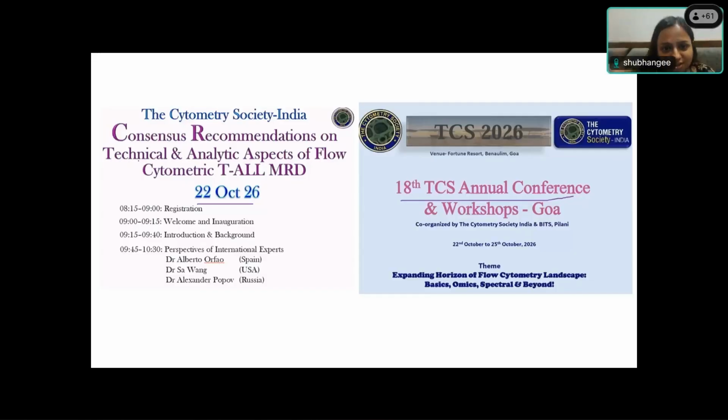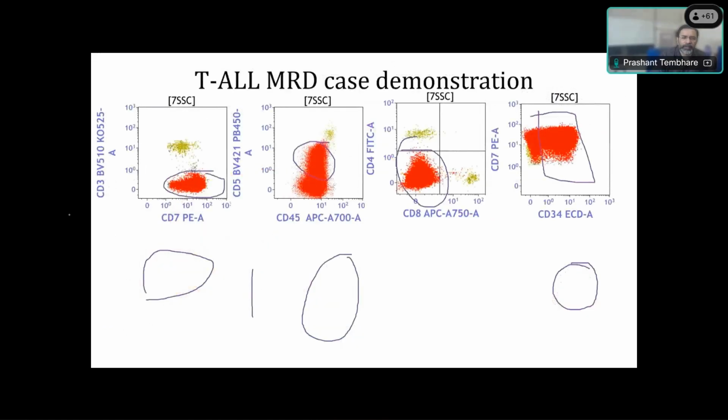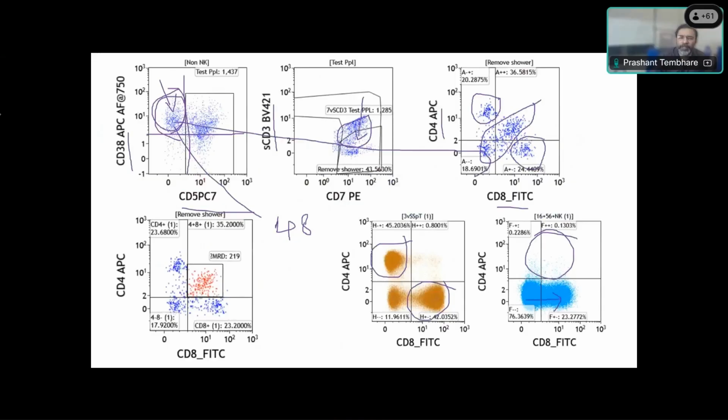Shower, sir. Shower check population. Okay, the shower check is simple, because when you have the shower population, they usually show normal CD4 distribution. For example, if this population is distributed here, you can see the CD4 and 8 is distributed. So this shower will show normal CD4 distribution.